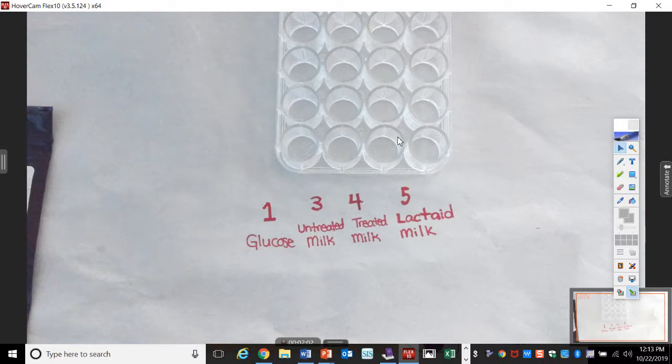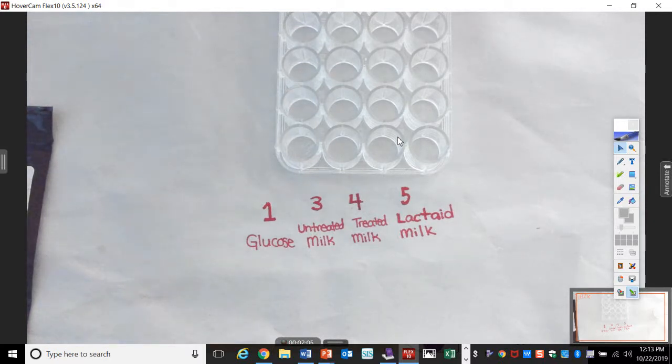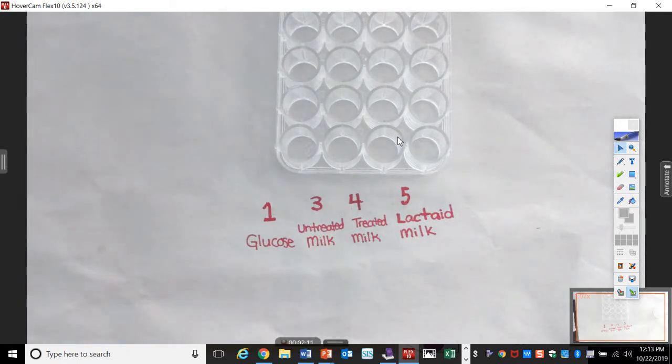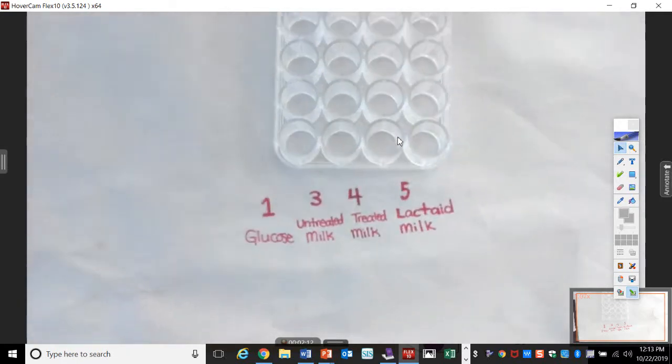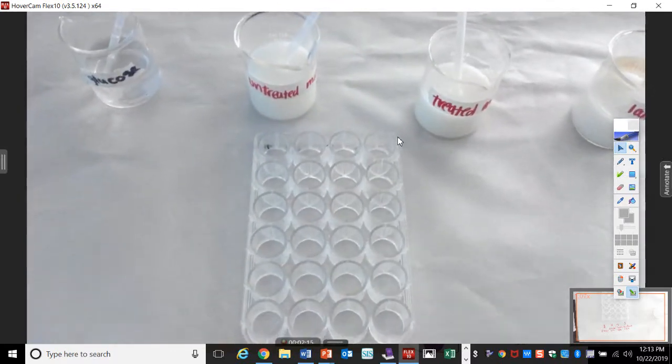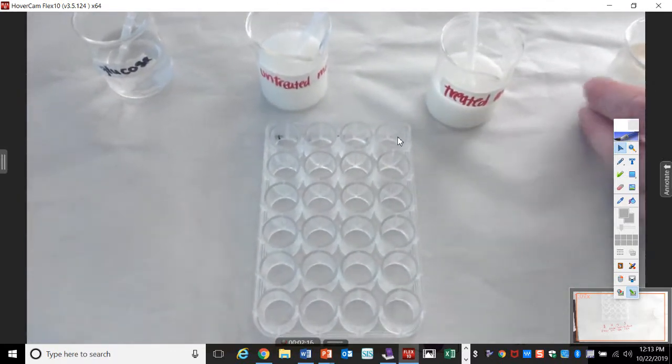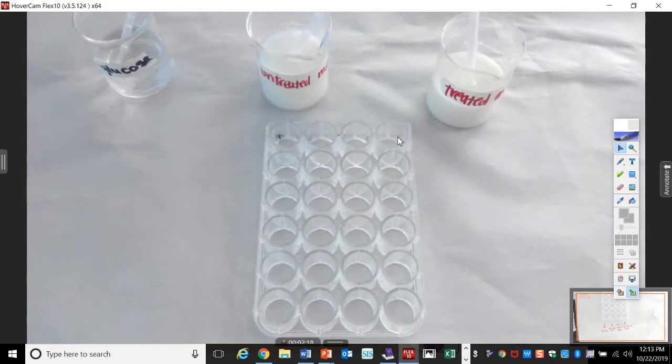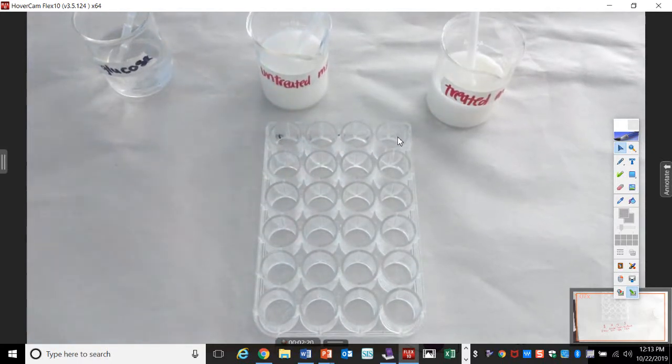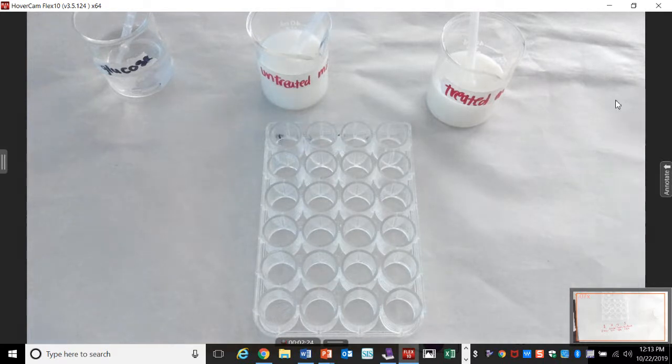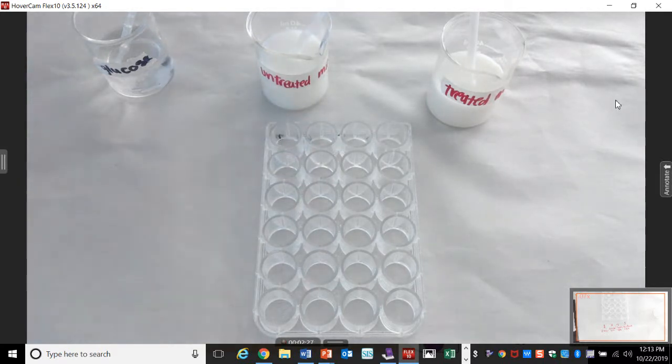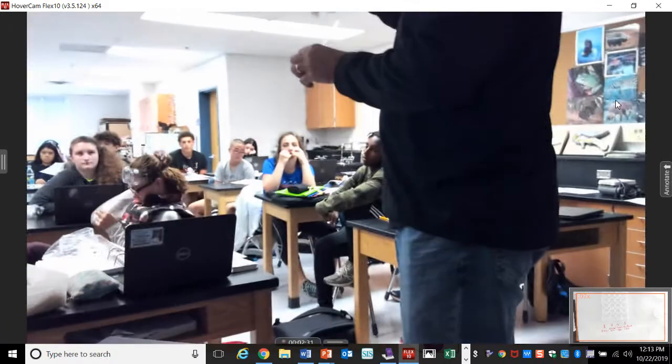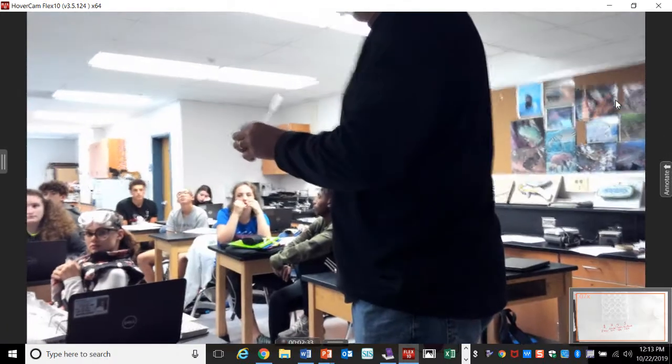So, logistics of doing this. We got in the back. So you have your well plate. Your well plate stays at your desk. You've got four group numbers. You're going to go back, pick up one little small beaker and the pipette. You're going to take this back to your desk, put your two, three drops in the appropriate well, whatever it's labeled. Then take it back so that other groups can use it.